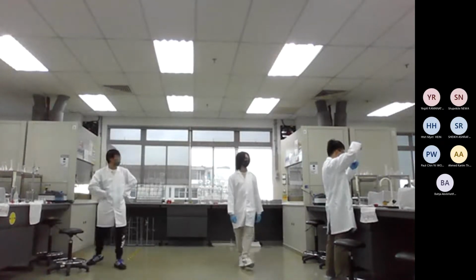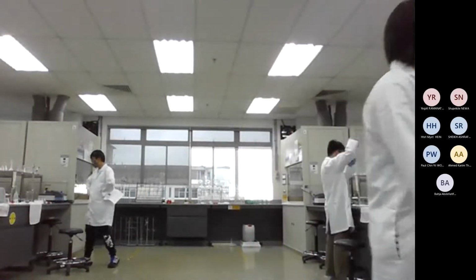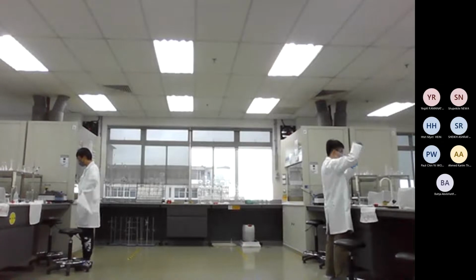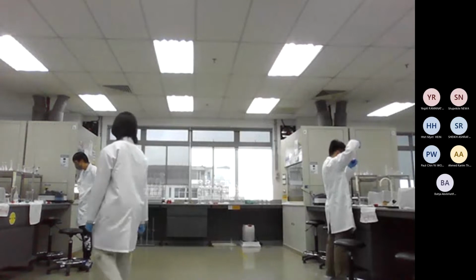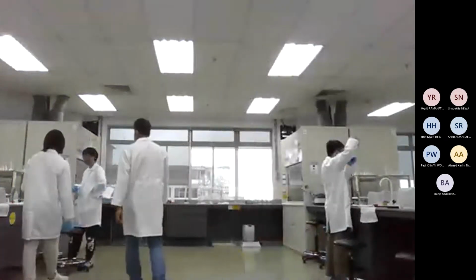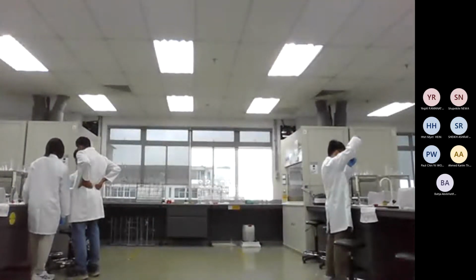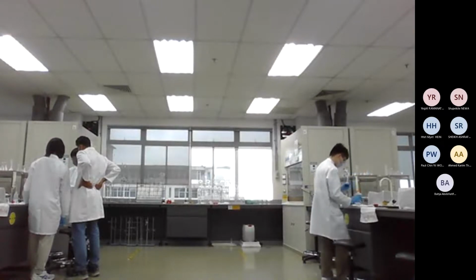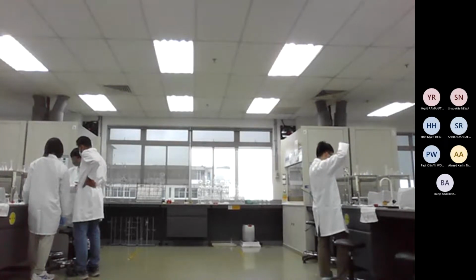Here is the chloride solution. Then take 5 milliliter from here and mix it with that 5 ppm. I think we need to do it well. Because for this one, we use the diluted one. We should not be using the undiluted one. Should be using the diluted one.